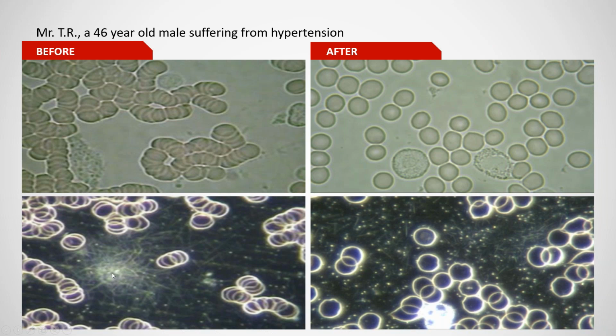And then in the image lower left-hand side here, these lines here are fibrin, and they work together with thrombocyte aggregation to actually form clots during the coagulation process of the blood. So these indicators that we saw here with this gentleman actually indicated a very high risk of cardiovascular health, potential issues with thrombosis and embolism as a result of the overactivity of the platelets here.